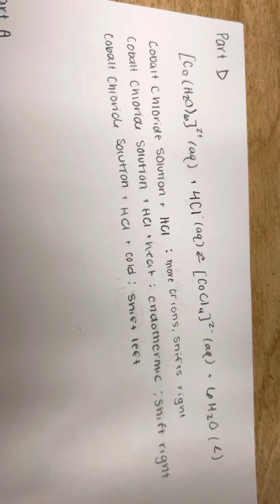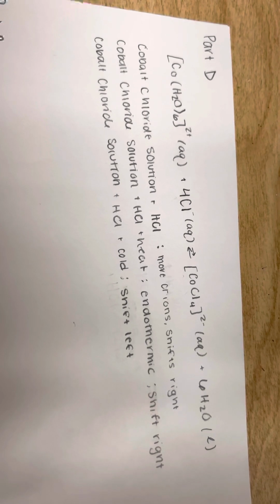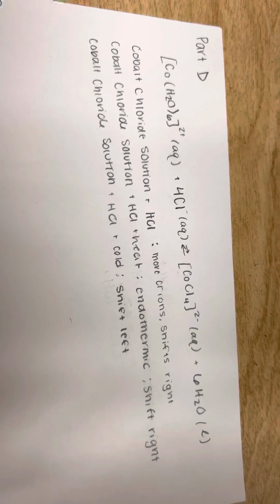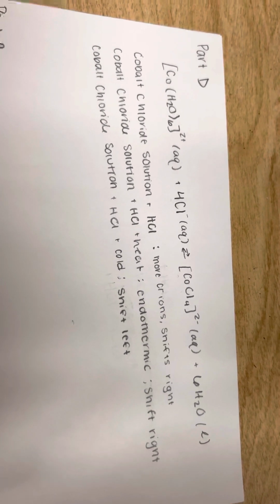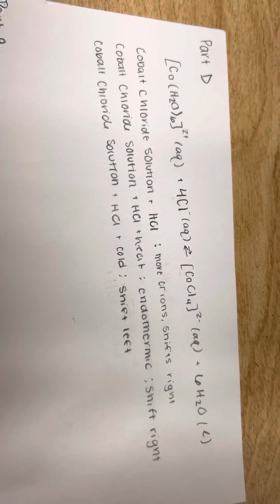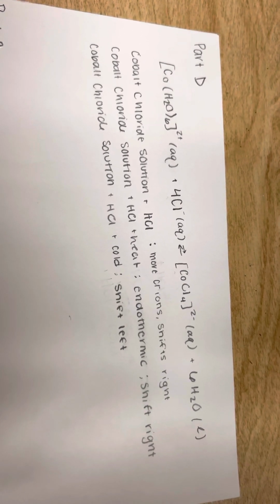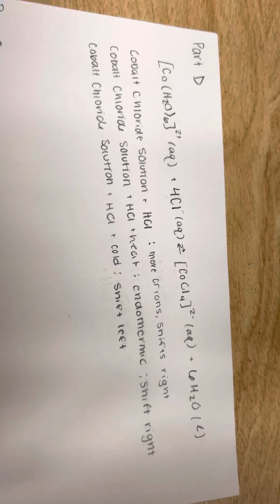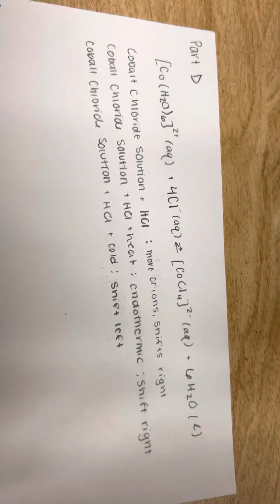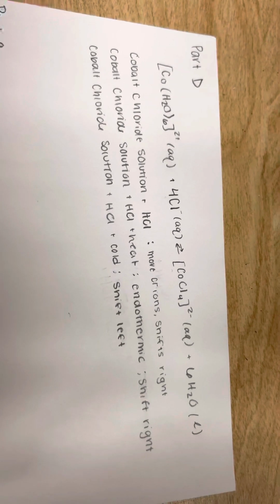And then whenever cold is added, the reaction goes back to a pink color, which we can see through the solution turning pink and shifting left. So we know that the reaction is endothermic based off when the heat and the cold are added or removed, because if it is heated, it is shifting right, which is dictating that it's endothermic, and if the heat is removed, it is shifting left, as it's placed in the cold. It is shifting left, therefore meaning that it is also endothermic.